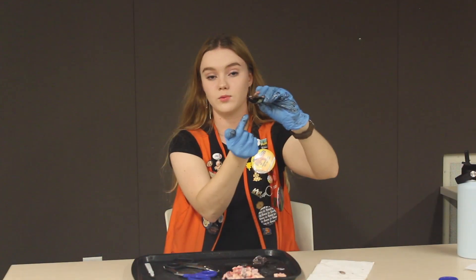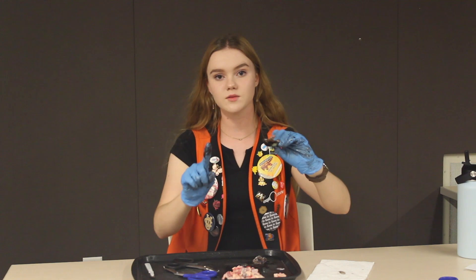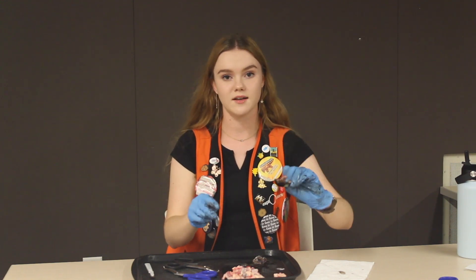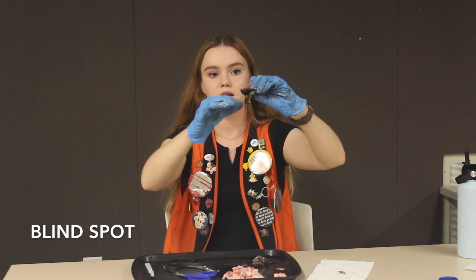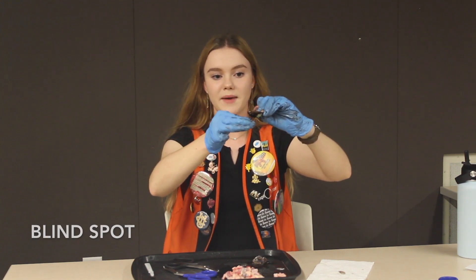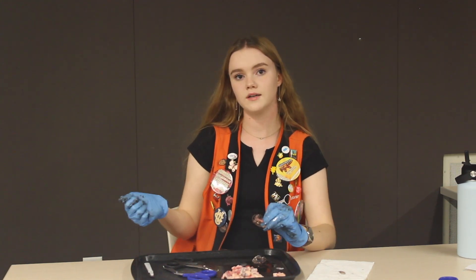What we're going to be talking about now is the retina, which is this right here. It contains two different types of cells: cone cells, which help us see color, and rod cells, which help us see light and movement. The retina is all connected at one point right there — that is called your blind spot. At the demo station there should be a paddle on the side in the drawer, and you can hold it out and explain your blind spot.